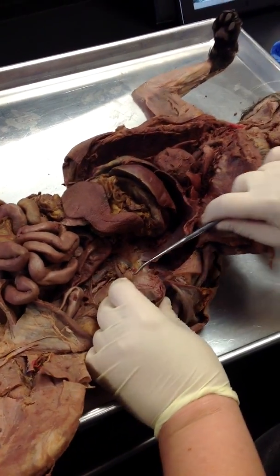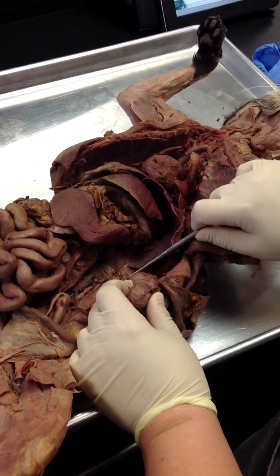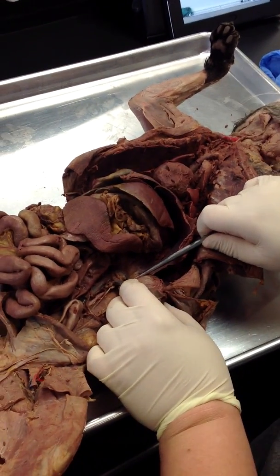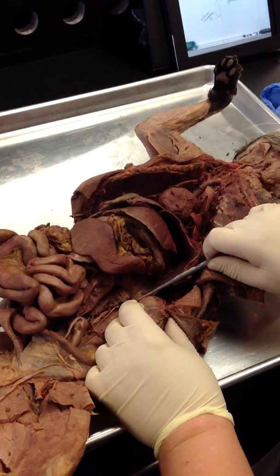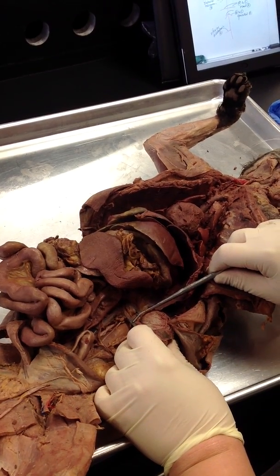And then going to the kidneys would be the renal artery and vein. Which side is this? The right, left. She paused. She didn't say anything. That's a bad sign, right? So remember, it's the cat's left, right? So this is the left renal artery and left renal vein, yeah.